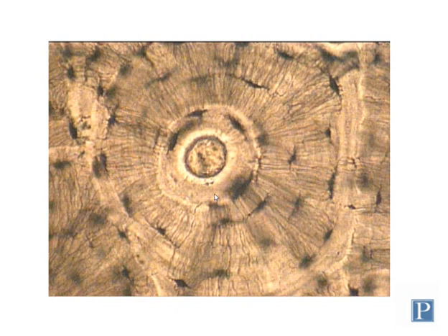Here's a higher magnification view, again, of a single osteon. You can see the structure of the lacunae at really high magnification here. And at this magnification, you can easily see lots of these little thin, spidery shaped or filamentous black structures.